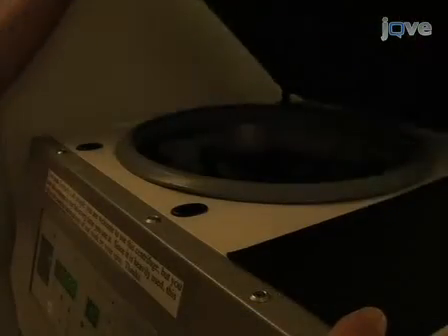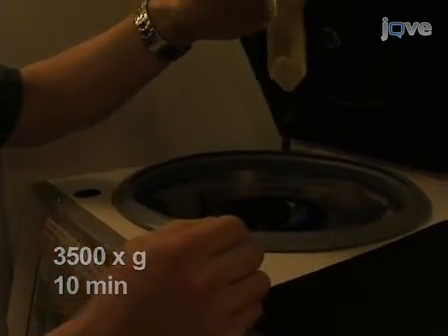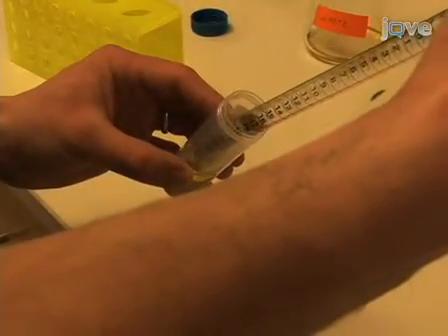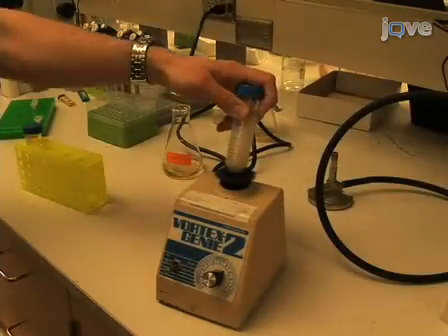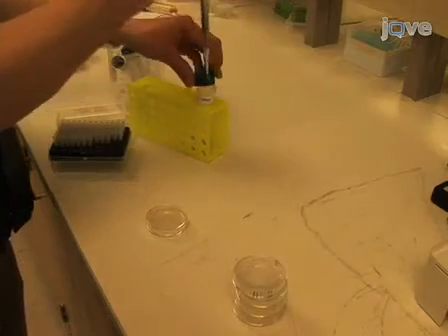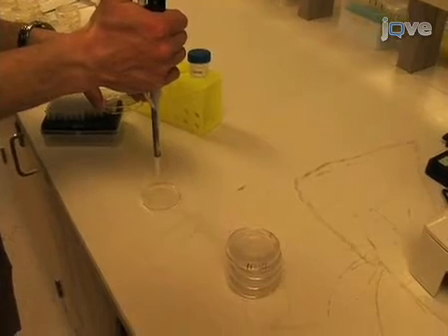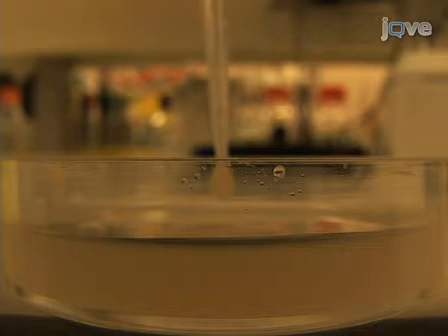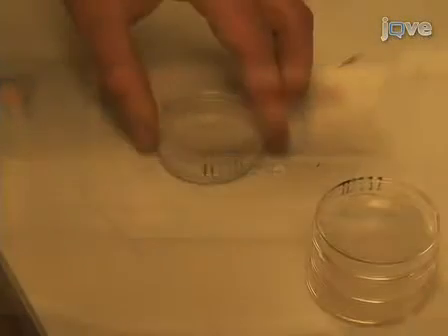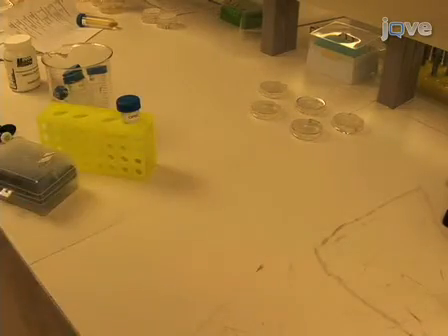Place the OP50 culture in a 37 degrees Celsius shaker and allow bacteria to grow overnight. The next day, pellet the OP50 bacteria with 3500 G of centrifugal force for 10 minutes. Decant enough of the supernatant to re-suspend the bacteria at a 10x concentration. Now inoculate each plate with 100 microliters of the concentrated culture. Avoid touching the pipette tip to the surface of the NGM, as flaws in the surface of the media will allow the worms to burrow. Swirl plates until the bacteria cover the central area of the NGM without coming near the plate walls, and leave plates to dry on the bench for 24 hours.